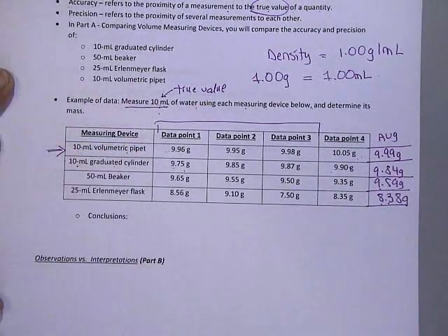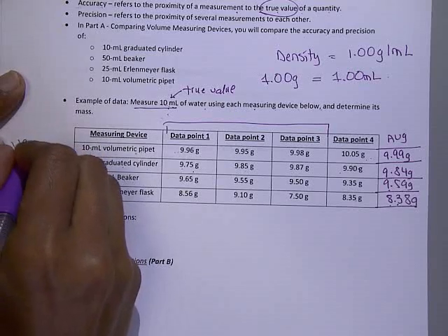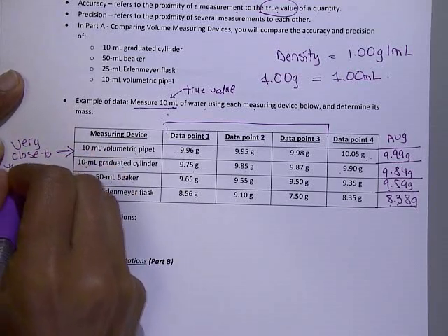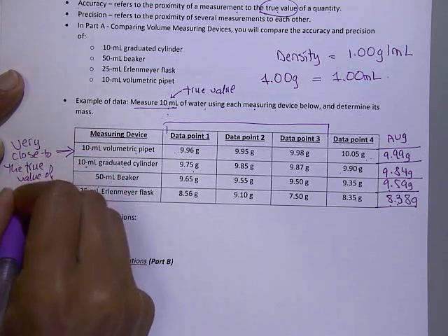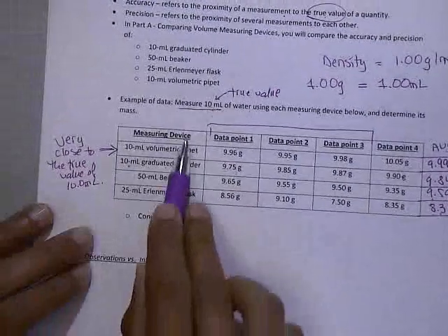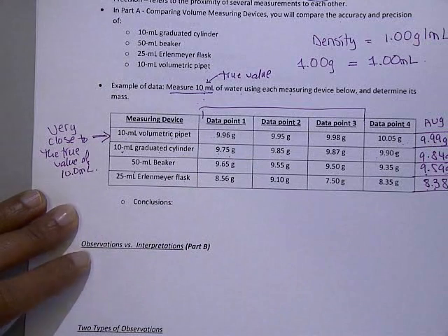Therefore, according to my data, the 10 milliliter volumetric pipette is very close to the true value of 10.0 milliliters. So what conclusion am I drawing here, which is expected for you for part A?